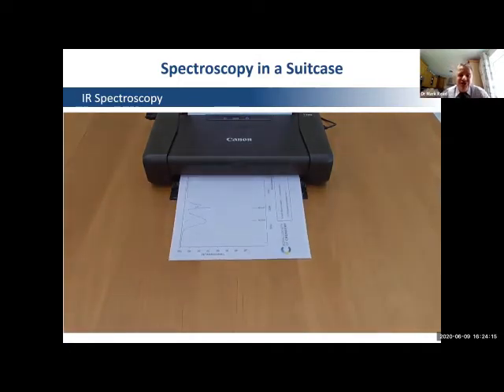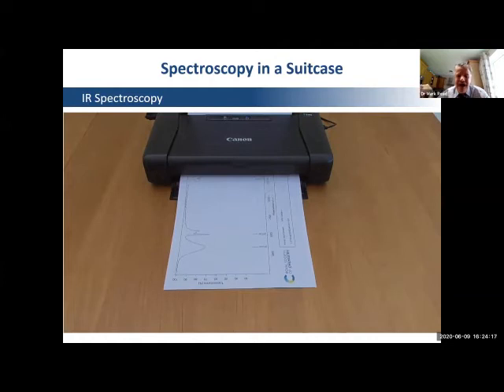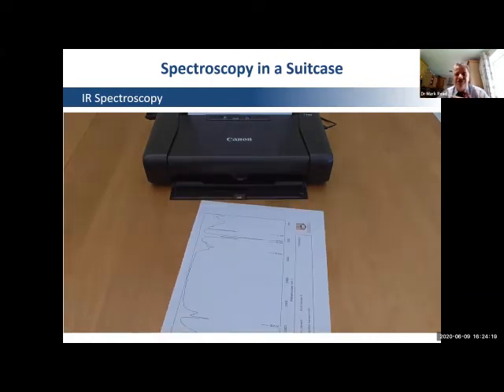And this is very useful because you can annotate the spectrum. And if you want to compare spectra, you can put 2 against each other, hold them up to light, and see which peaks are there, etc. So that, in a nutshell, is how we run a sample.